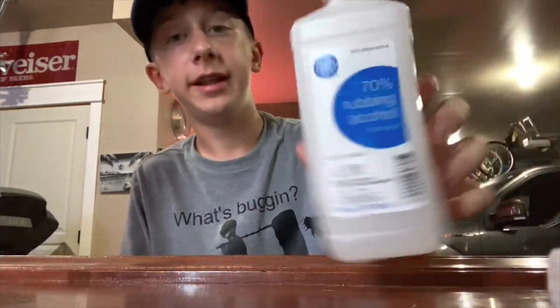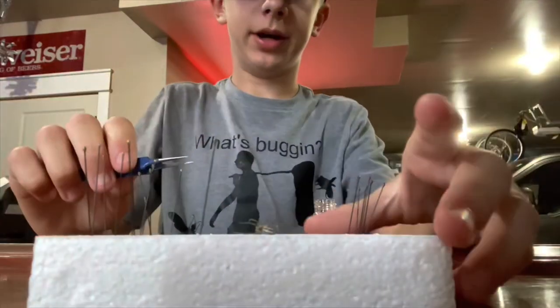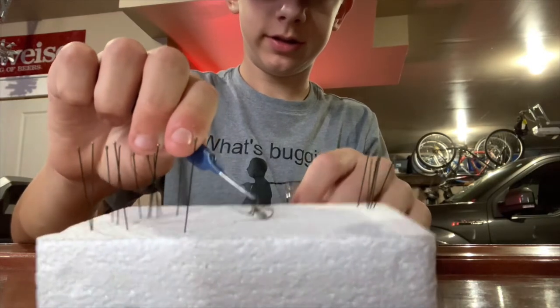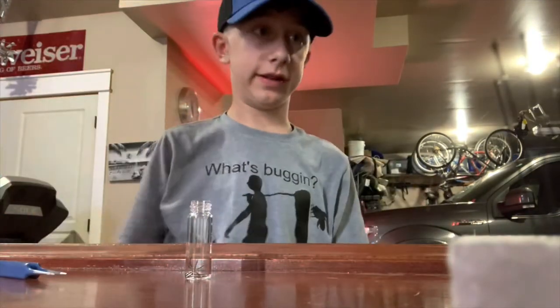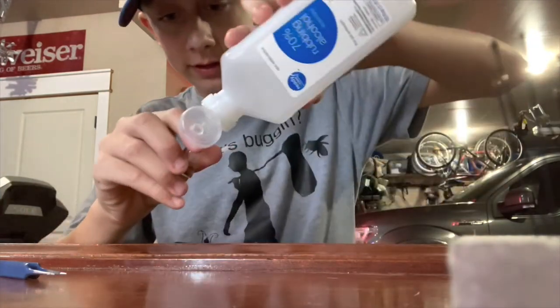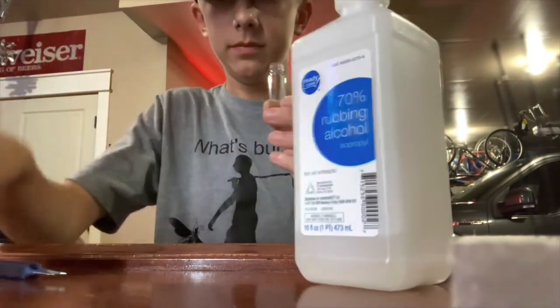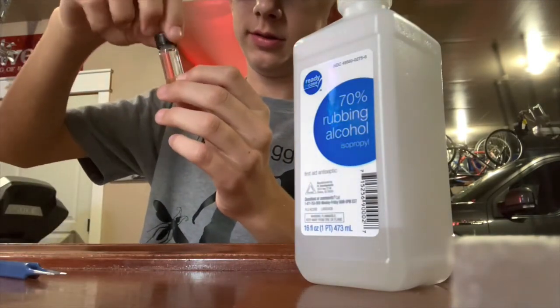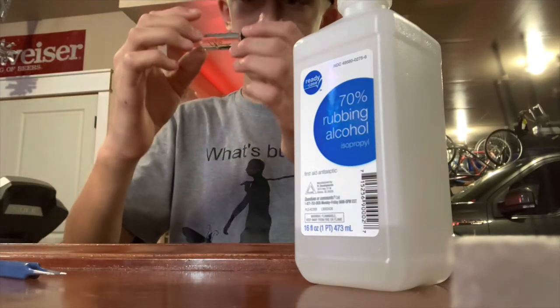You'll need a vial — any vial works as long as the bug fits in it — and 70% rubbing alcohol. Get the vial, open it up, and just put the bug inside. That was easy since this one isn't that big. Then get your rubbing alcohol and pour it in. It's the perfect amount, no spills. And then you've got yourself an alcohol specimen.